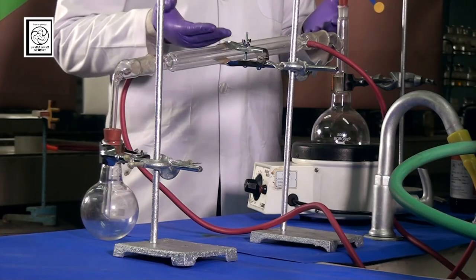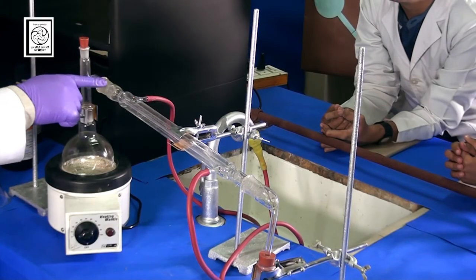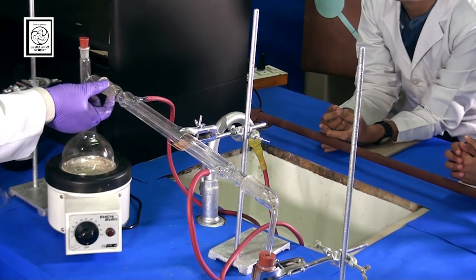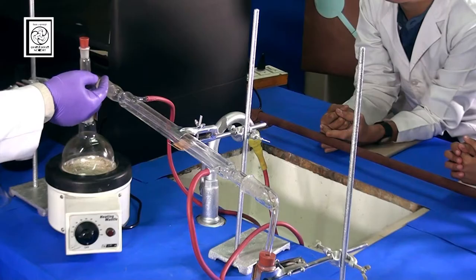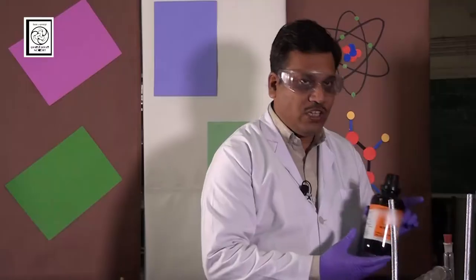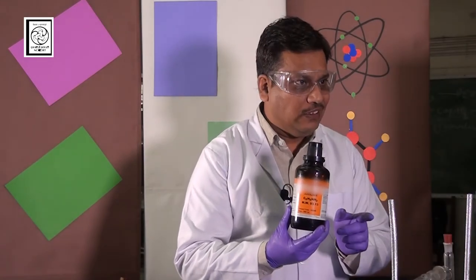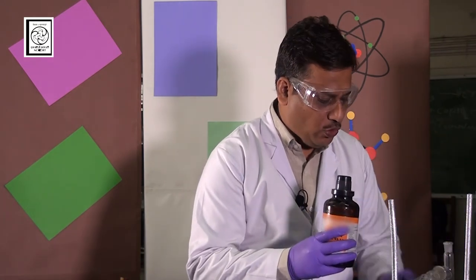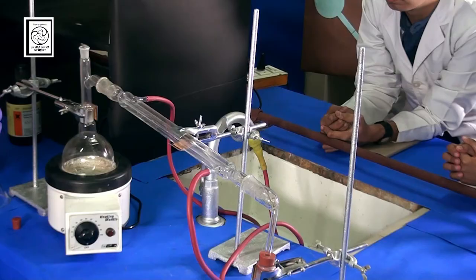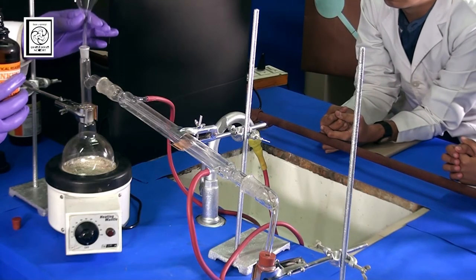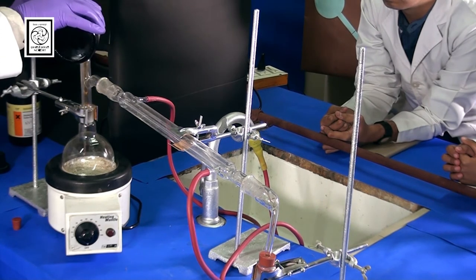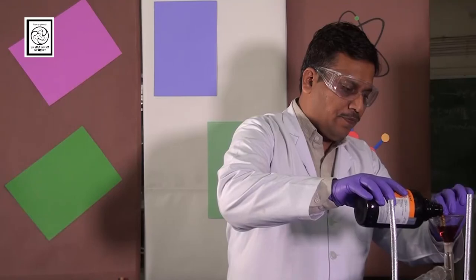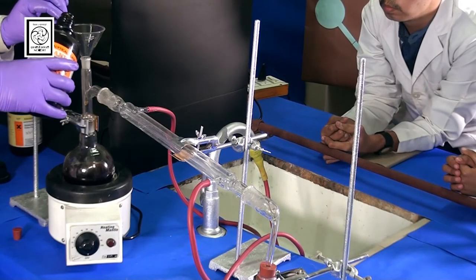But before starting, one precautionary note for you: carefully adjust the angle of adapter with condenser so that liquids should not come out here. Okay. Now I am adding this impure sample of aniline to this distillation flask. I can use the funnel for the purpose. Here I am adding the aniline impure sample.